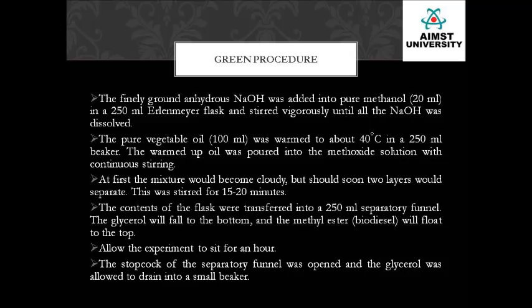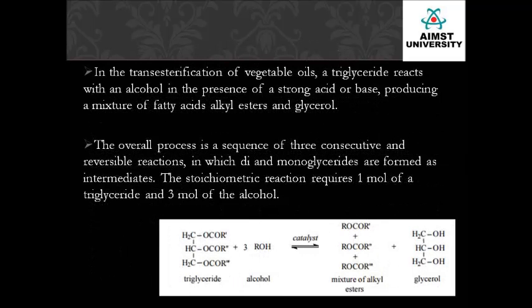The stopcock of the separating funnel was opened and the glycerol was allowed to drain down into a small beaker and collect back the obtained biodiesel. In the transesterification of vegetable oils, a triglyceride reacts with alcohol in the presence of a strong acid or strong base, producing a mixture of fatty acid alkyl esters and glycerol.